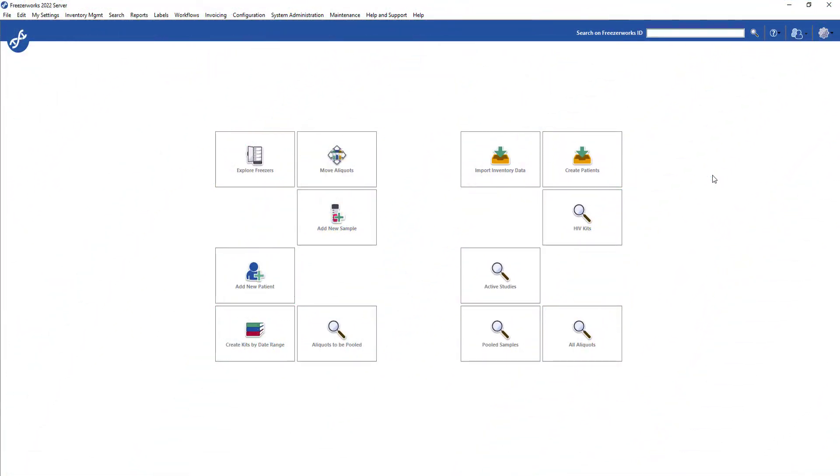Hi there, and welcome to the FreezaWorks 2022 learning series, your visual guide to our new and improved sample management software.